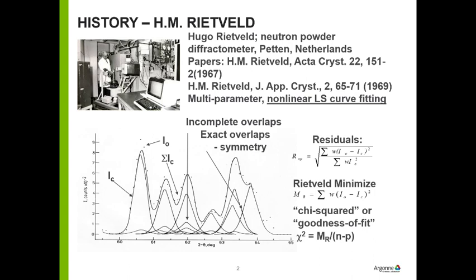The reason why I emphasize this is if you go back and look at the history of the Rietveld refinement method, there's going to be a whole bunch of papers that go through a bunch of controversy about it back in the middle 70s and early 80s, where the authors basically got very confused about that point, and they were busily counting reflections and all that sort of stuff, and it was completely misguided because this is a curve fitting exercise, has nothing to do with single crystal reflections.